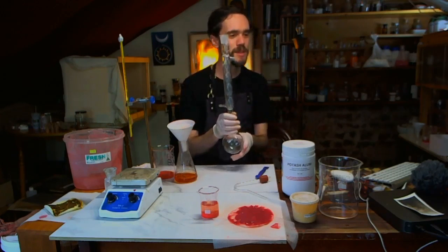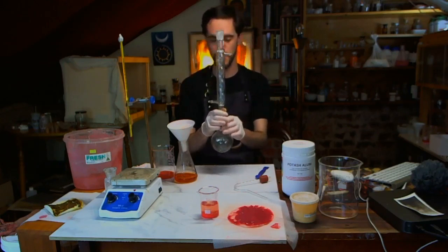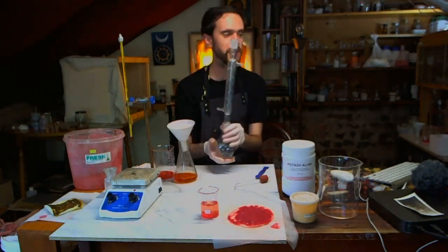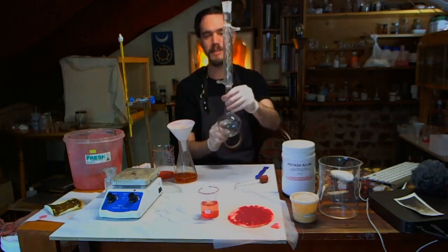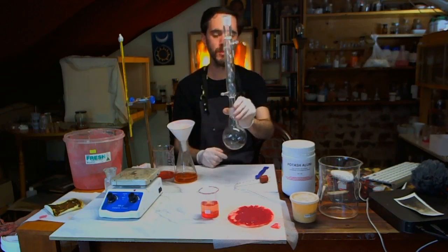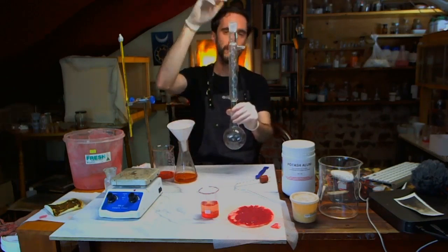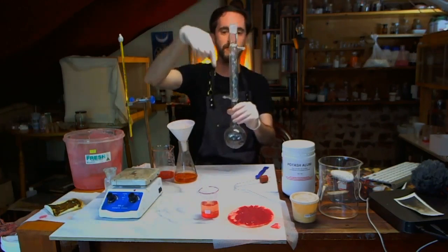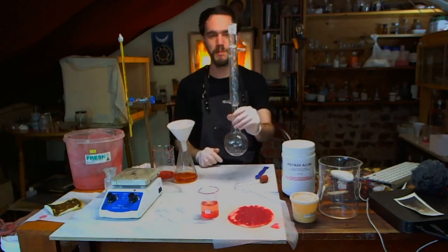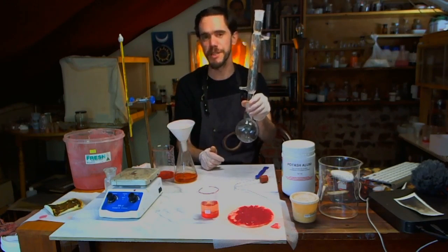Barium's only a tiny bit safer than lead. Barium's pretty toxic as well, but definitely a little bit better. But yeah, making your lead acetate this way, just through a reflux, would be a good situation as well. Again, you can connect this to something else to vent any vapors that do escape, but refluxing should be a good way to keep from losing any of the acetic acid either.